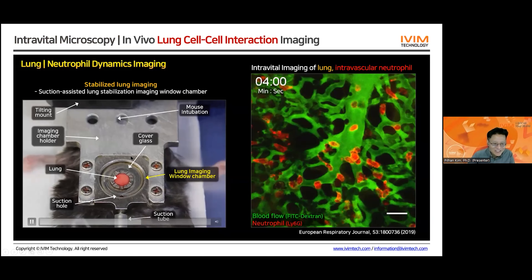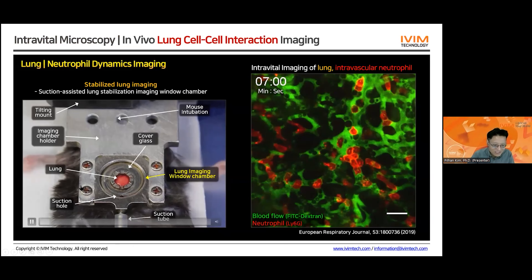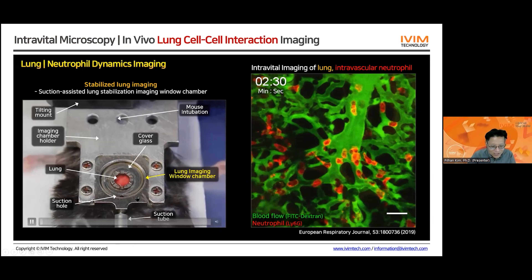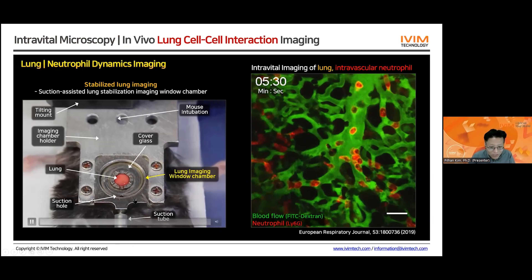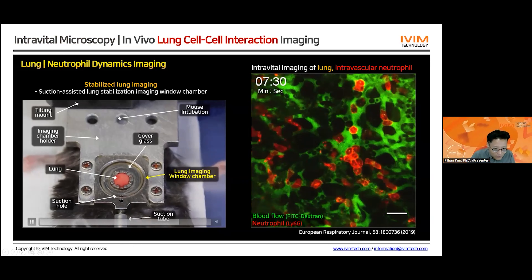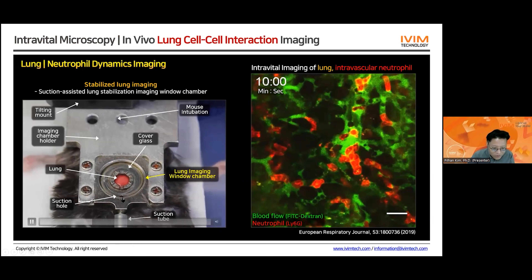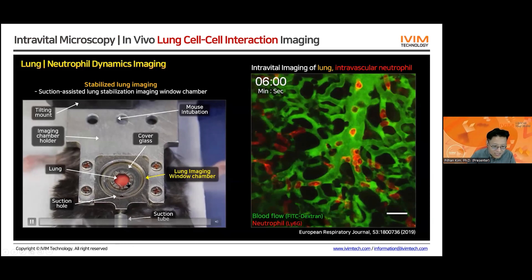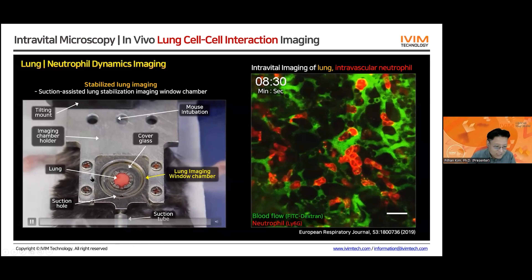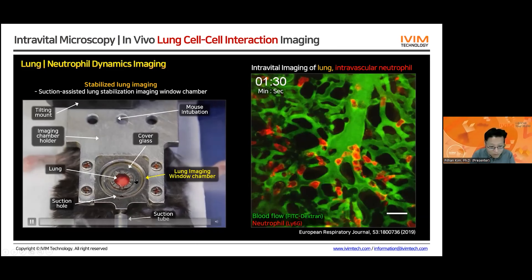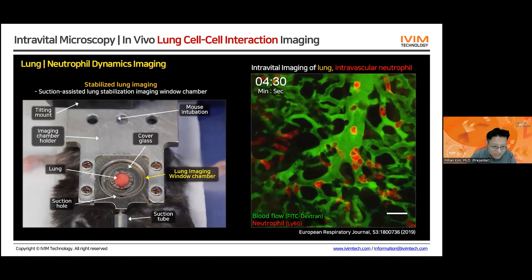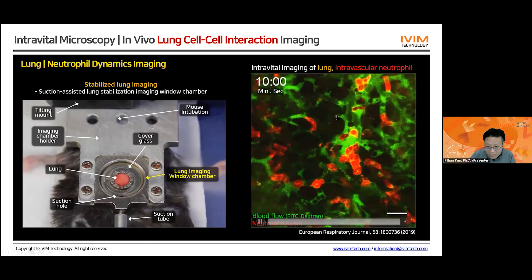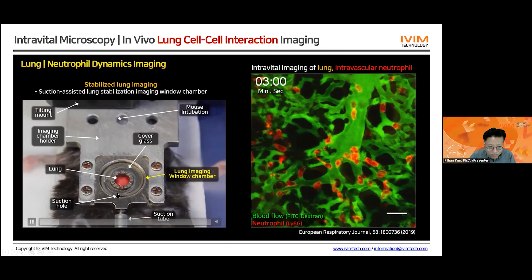This is the same video showing how we do it. In this particular example, the mouse is intubated and connected to the ventilator. In the middle is the lung imaging window chamber. We have a small suction hole to suck out the air from the chamber, build up negative air pressure inside, and by doing that, we stabilize the motion of the lung against the transparent cover glass. After this preparation, we can take this stabilized video from the lung.